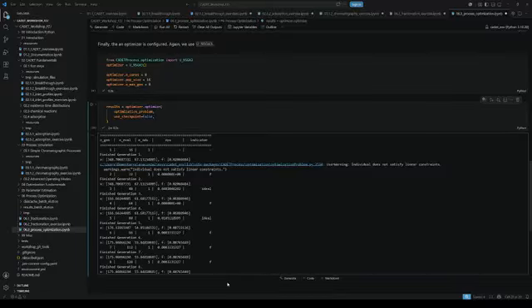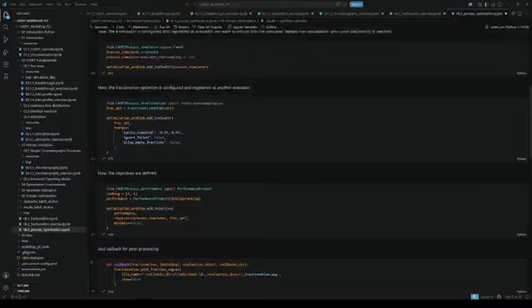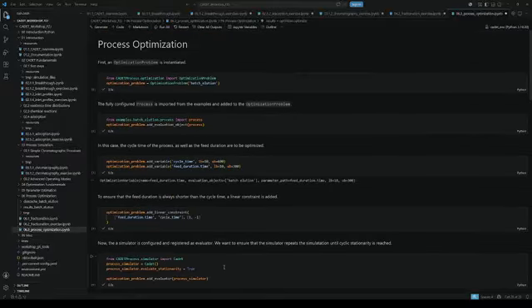All right, this was a quick introduction into what is possible with chromatography or mechanistic modeling of chromatography processes using the software CADET. CADET is, I would say, the rising available software used for this type of modeling because it's open source and free to use. It does have drawbacks compared to other available systems.